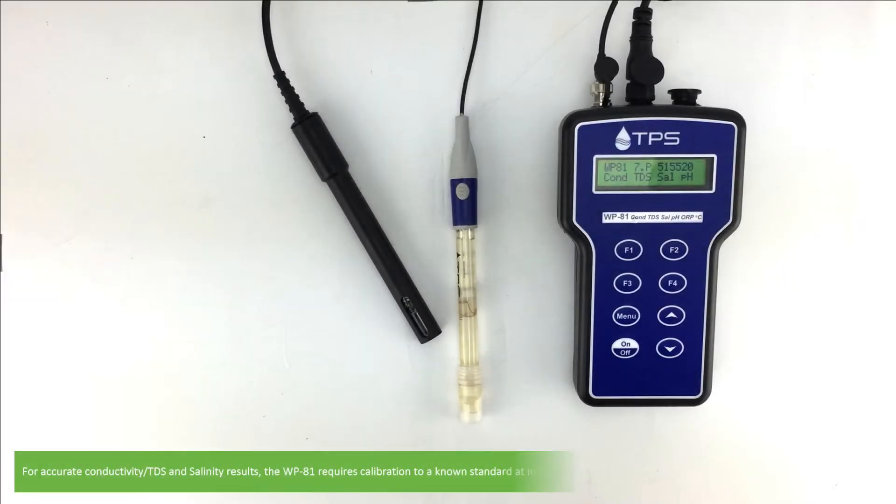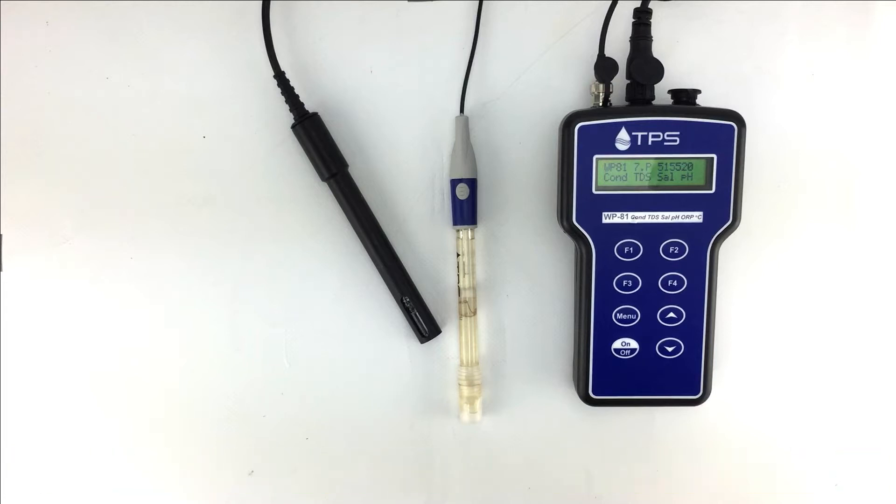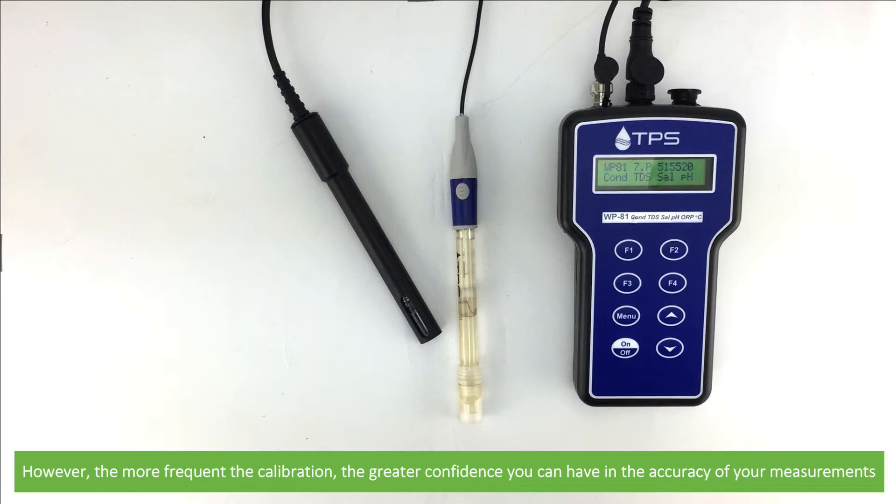For accurate conductivity, TDS, and salinity results, the WP81 requires calibration to a known standard at least weekly. Zero calibration should also be performed at least monthly. However, the more frequent the calibration, the greater confidence you can have in the accuracy of your measurements.